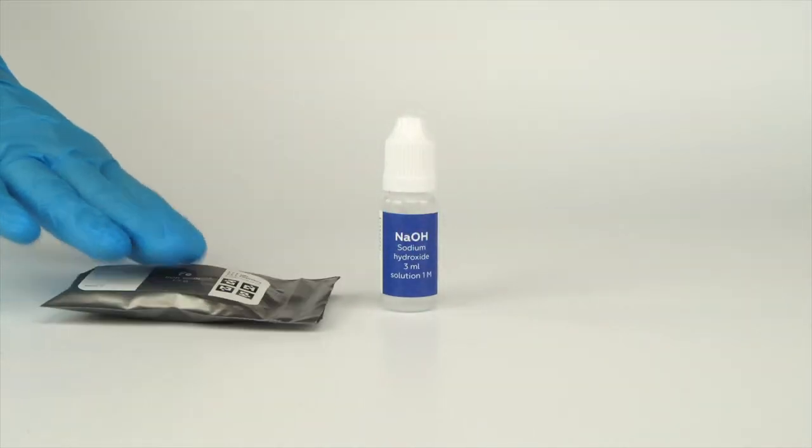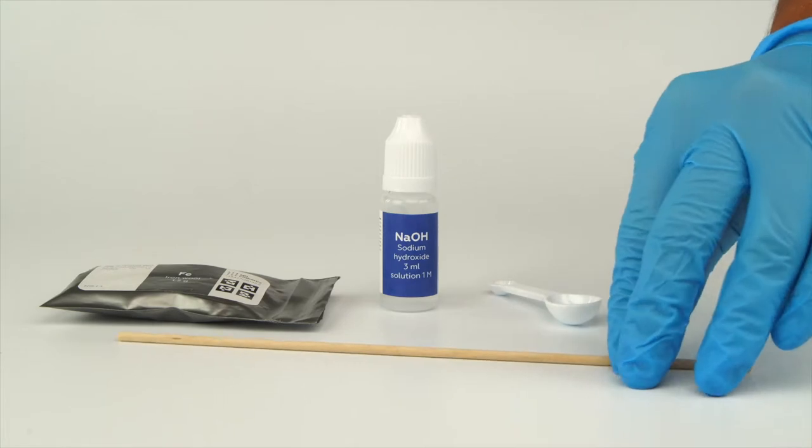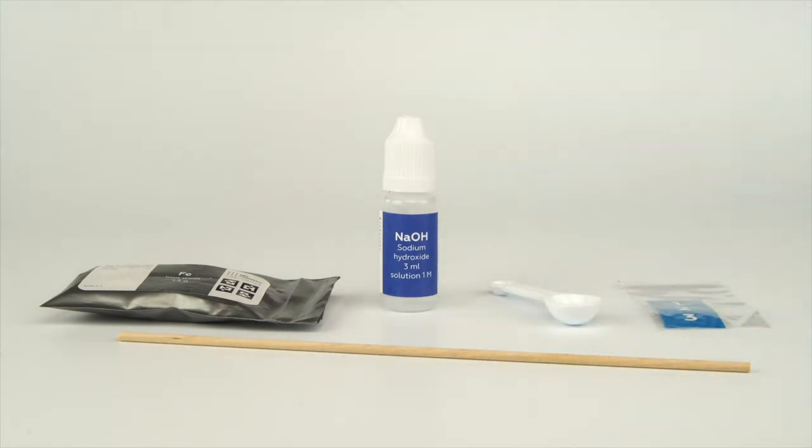For the iron corrosion experiment, you will need sodium hydroxide solution. Take the iron wool, measuring spoon, wooden stick, and numbered stickers from the experiment set.